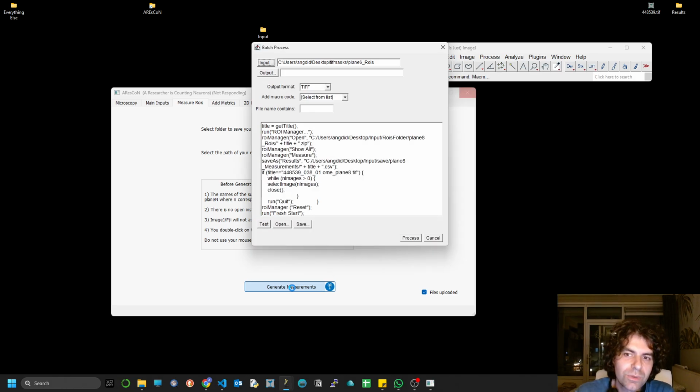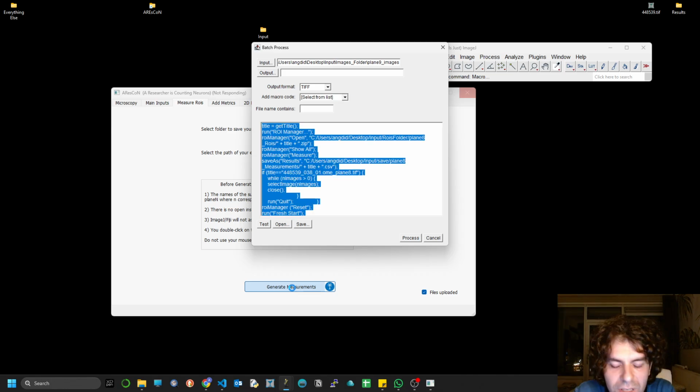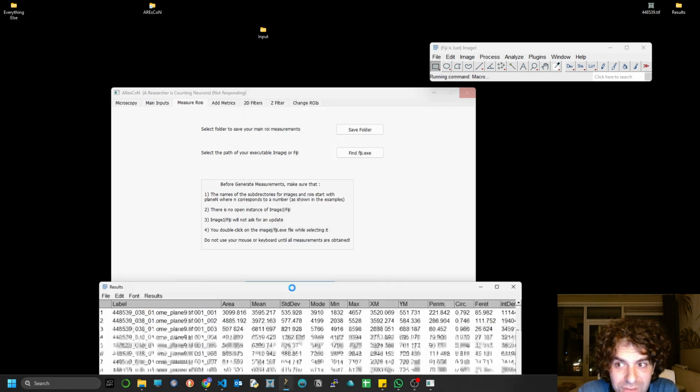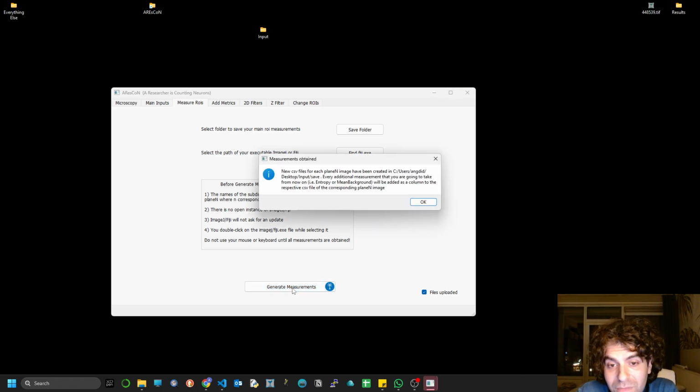The problem is that when you open Fiji, it already is indicated, in a sense submitted, in the processes of the task manager. So I haven't found a very reliable way to overcome this problem, and the way I resolve it is that I leave that gap between executing Fiji and typing the macro command on the search bar.